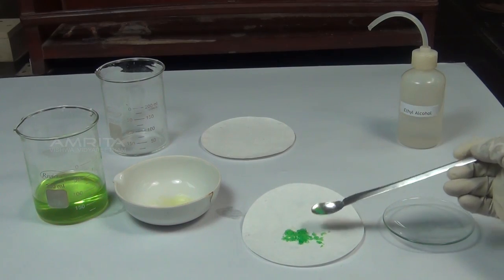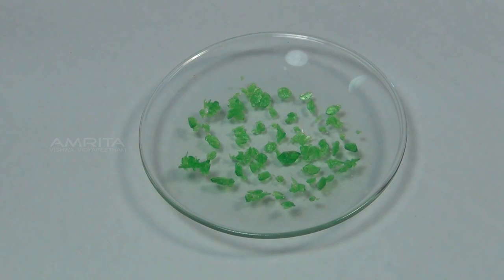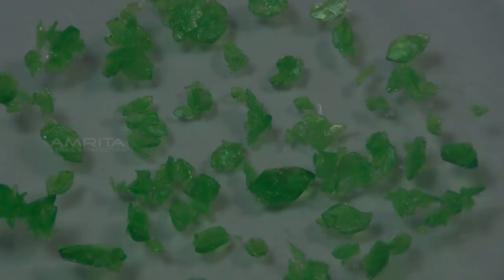Now transfer the crystals into a watch glass. The crystals of pure potassium trioxalatoferrate-3 are emerald green in colour and are octahedral in shape.